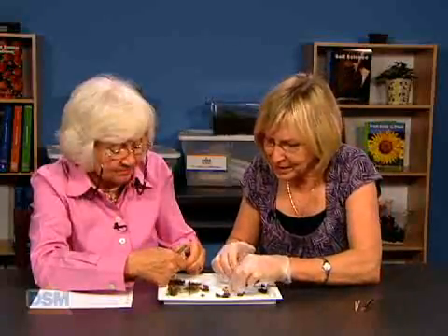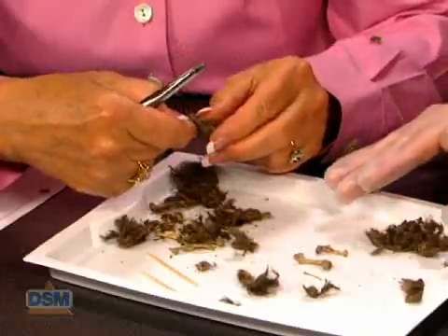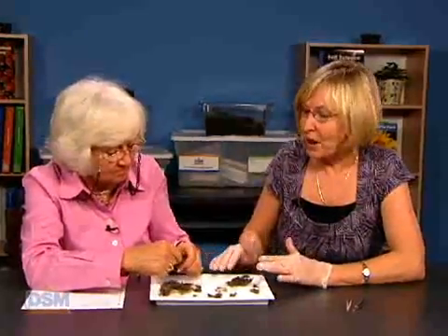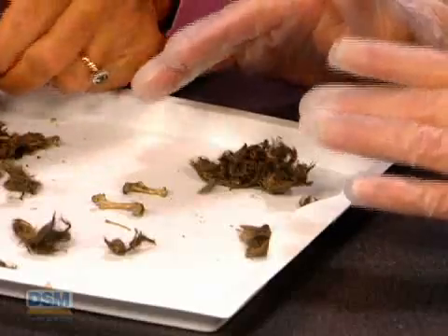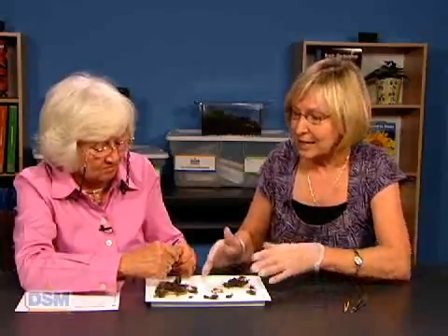Well, it looks like we are seeing some bones here, so it's going to take us a while to get this apart, but what you might want to do at the end of this first session, after students start seeing that they have bones in here, they might want to go on and explain to them that this came from an owl. And at this point, then we can start calling it an owl pellet. So we want to collect the materials and bones because we're going to use it again in the second session.